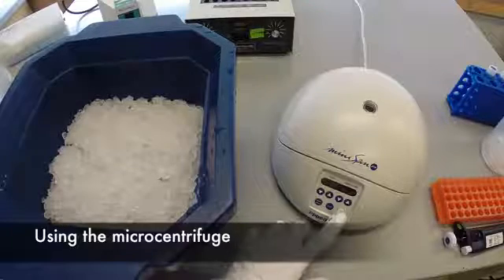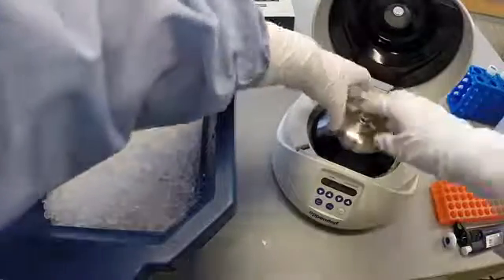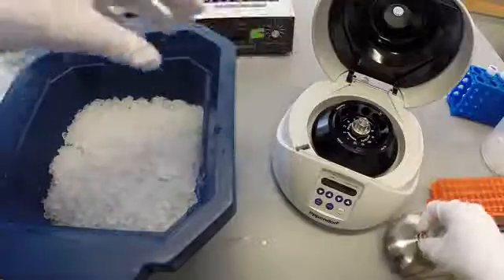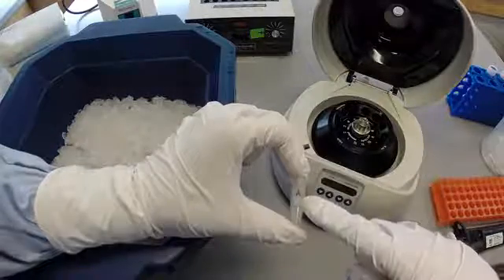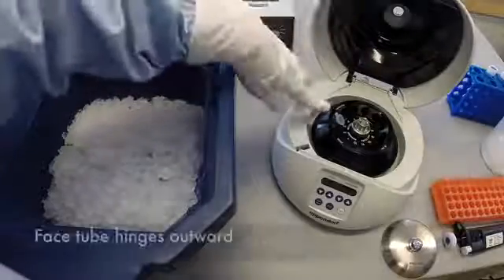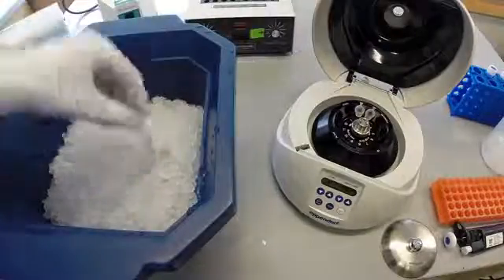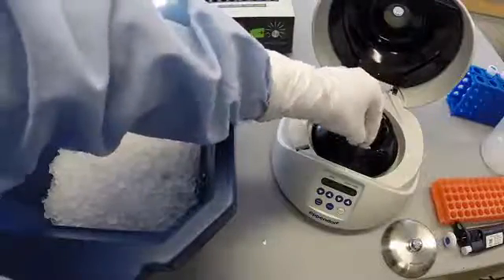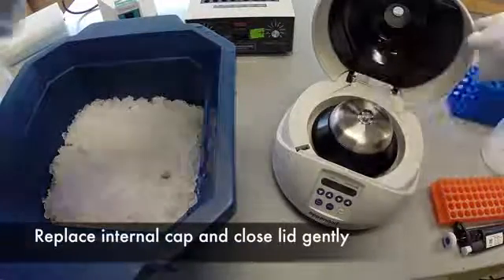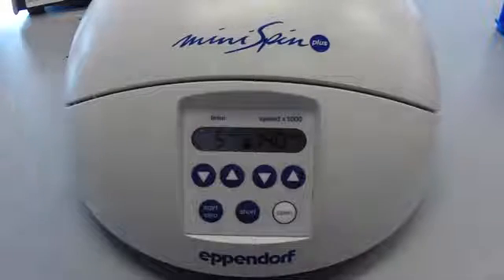After flipping the switch in the back of the microcentrifuge, press the open button. Remove the metal lid inside by pulling on the knob. Make sure that the tubes are labeled either with letters or numbers before loading them into the centrifuge. Load samples with hinges facing outward, and balance the tubes across the rotor by ensuring that all tubes have equal volumes. Replace the metal lid and press it until it clicks securely onto the rotor. Close the lid to the microcentrifuge gently. Change the centrifugation time by pressing the arrows to the desired time — in this case, 5 minutes.